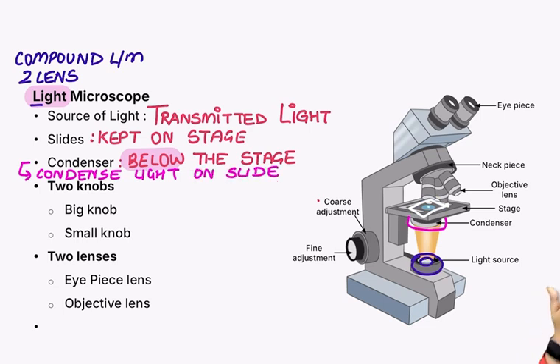So imagine light entering your eyes or light entering the camera. There is some adjustment you can do, like you have a diaphragm in the camera which you can close and open so that the amount of light is varying. Similarly, this condenser is also going to have inside it something that is known as a diaphragm. Finally, if I trace the light, I can see that the light was going everywhere, but the condenser said no, you only have to go to this hero, that is the slide. And after this, the light will now start going to the lenses.